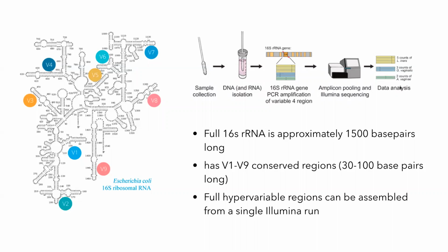And also for library preparation, this is actually going to be important because one of the biggest considerations for library preparation of environmental samples for shotgun metagenomic sequencing, like we talked in the previous slide, it has to do with this amplification. What do we amplify?